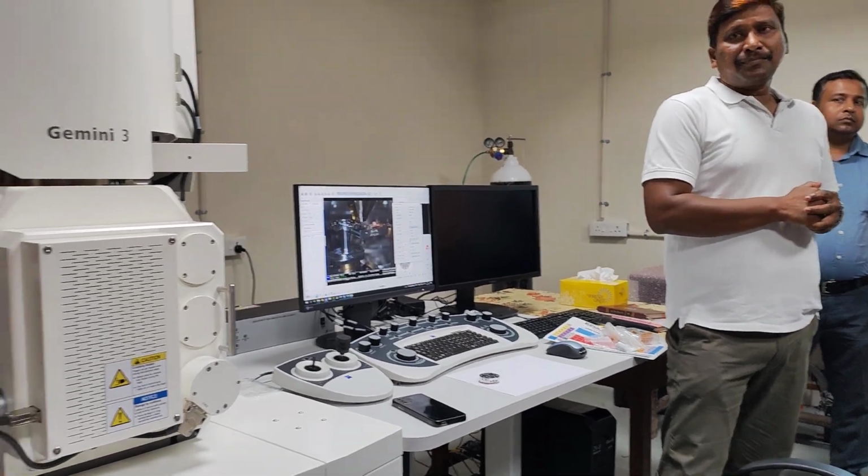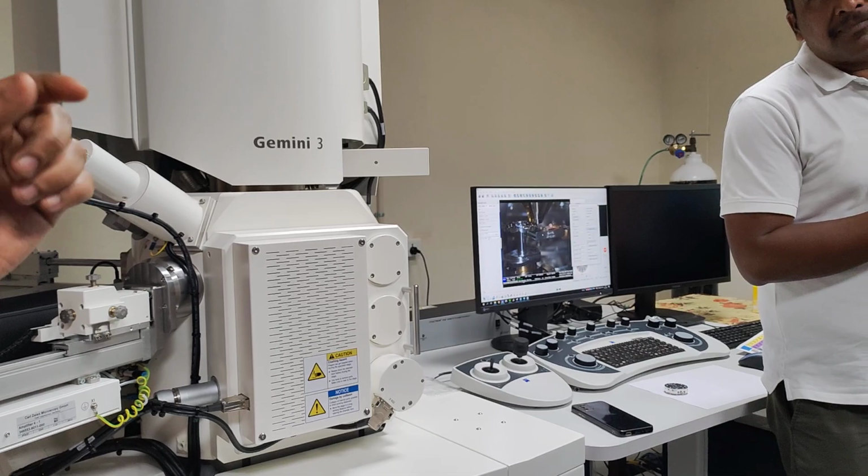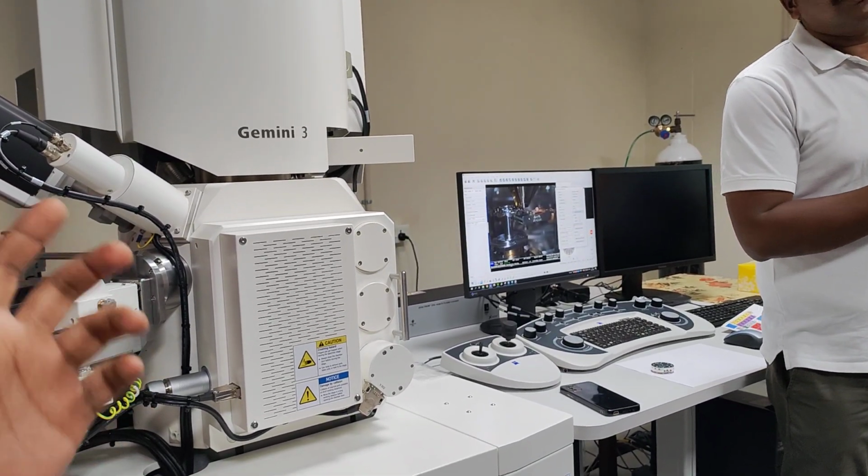Sir, is there any limitation on what kind of material can be imaged? Like in XPS, they sometimes avoid sulfur groups. So, is there any such limitation?